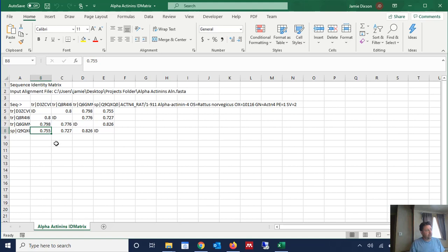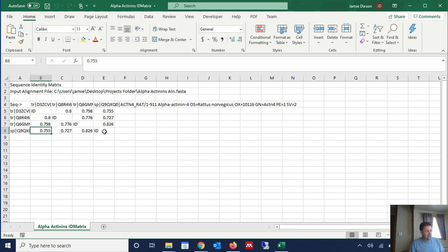You can reformat it in Excel however you want to. Of note, you really don't need the upper triangle of the matrix for a whole lot of different analyses. Including if you were going to publish this, you probably wouldn't want to show both upper and lower identity matrices because they're the same.